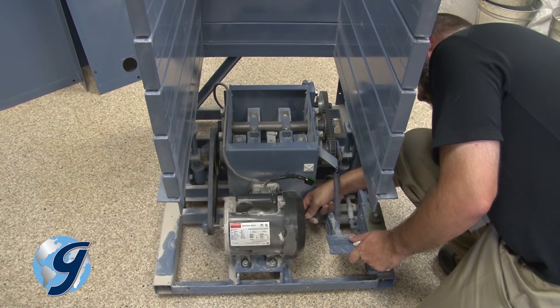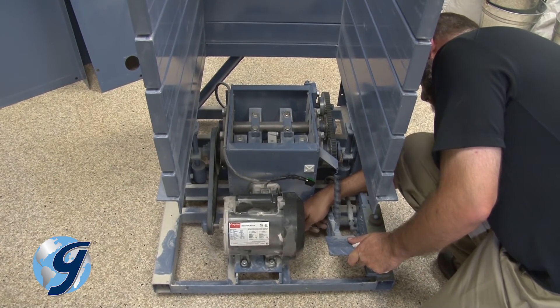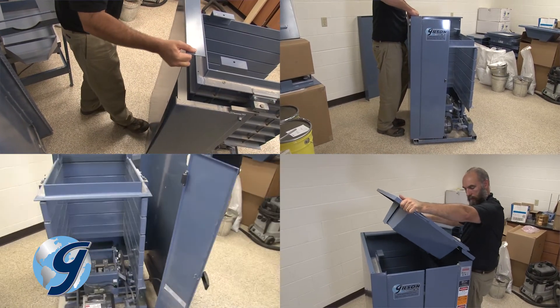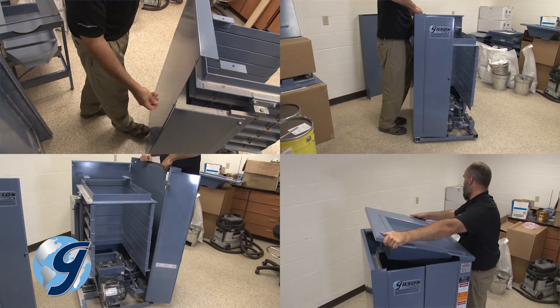You have removed the panels of the Test Master to inspect, adjust, or repair your Test Master. Once that is completed, it is time to reassemble the panels of the unit.